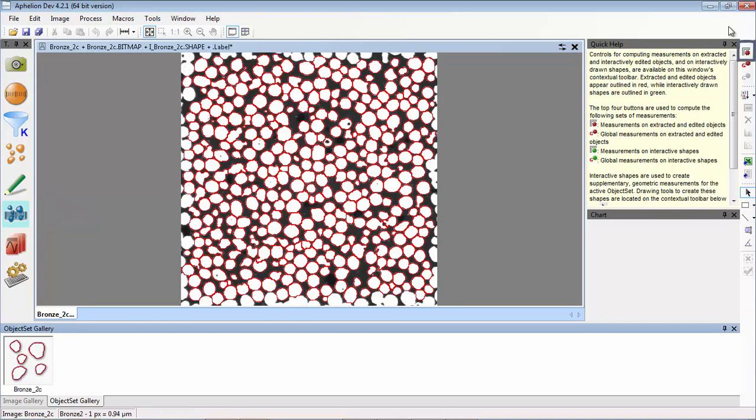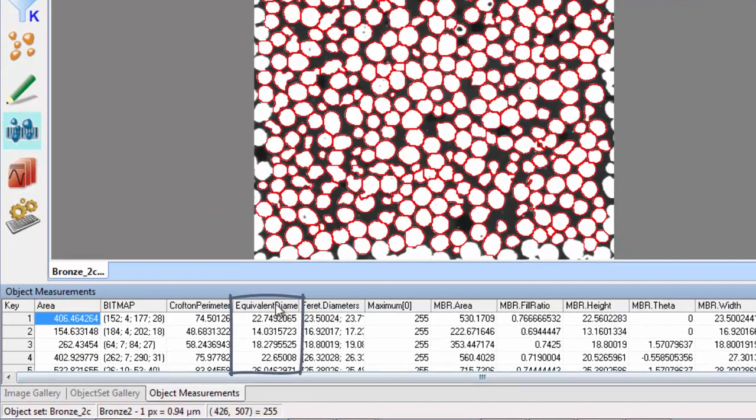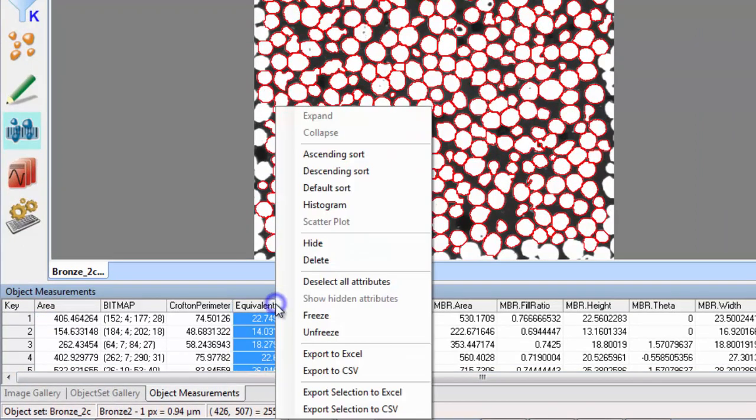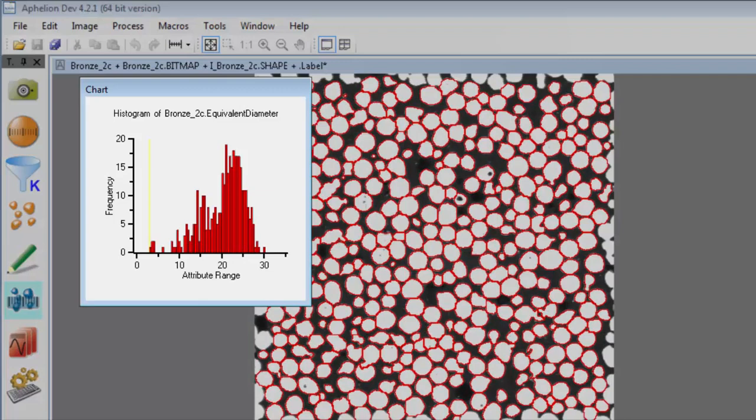We then measure many different properties of the objects to produce a table of results that we can use to examine a specific property, such as the particle diameter. We can then also view that result in graphical form.